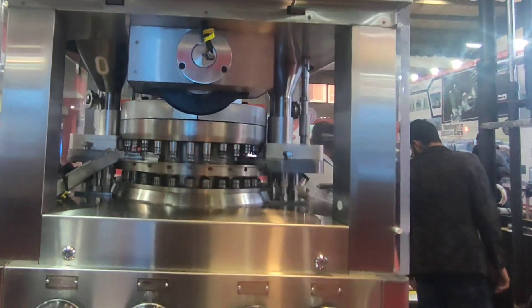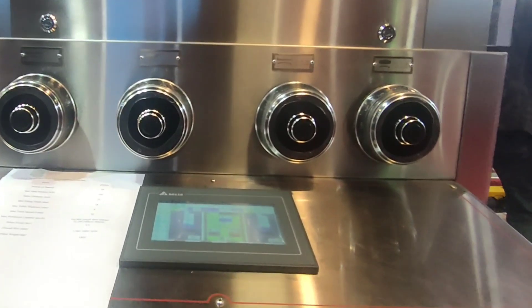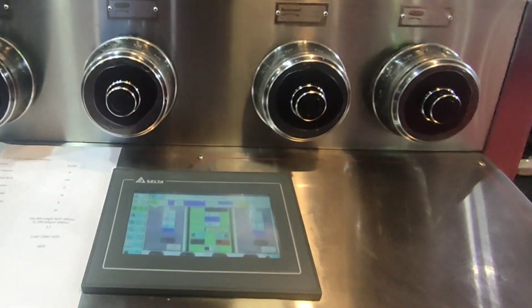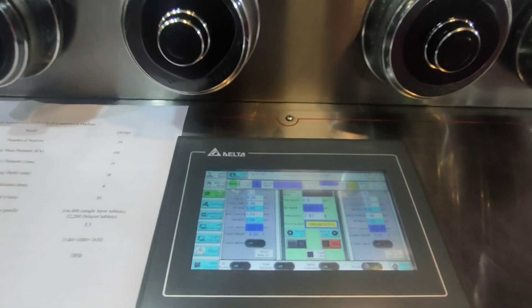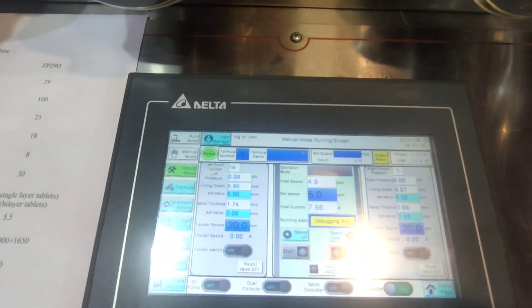This one is the hopper of the tablet compression machine. For double feed tablet compression machines, we have two hoppers — one on the right side and one on the left side. Here we have the weight and hardness adjustment controllers and HMI of the compression machine.